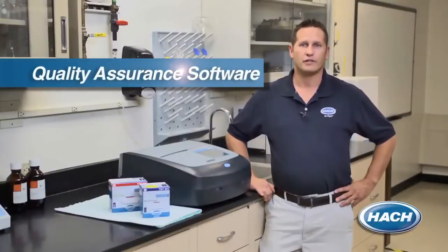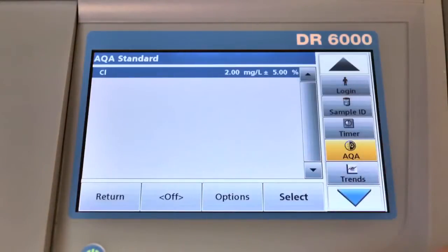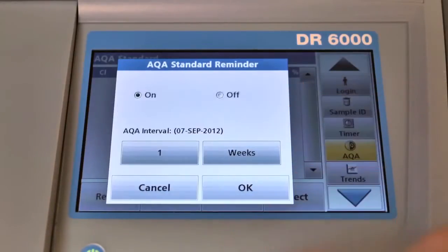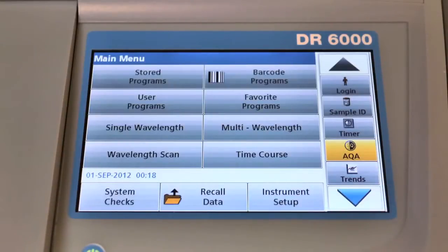To help ensure your results are error free, the DR6000 comes with integrated quality assurance software for scheduling, documenting, and interpreting your quality measurements. The software allows you to define your own standard settings and reminder intervals, provides pass-fail indicators for your standard measurements, and recalls control charts with the push of a button.